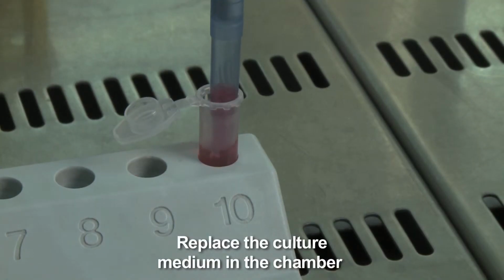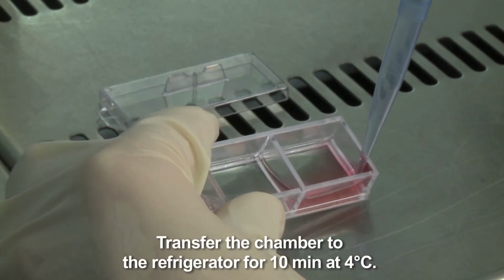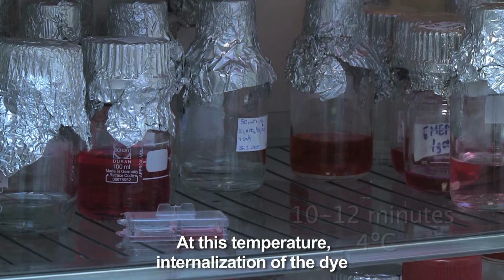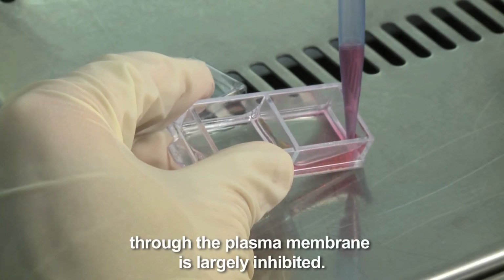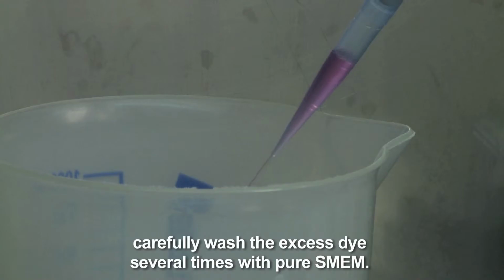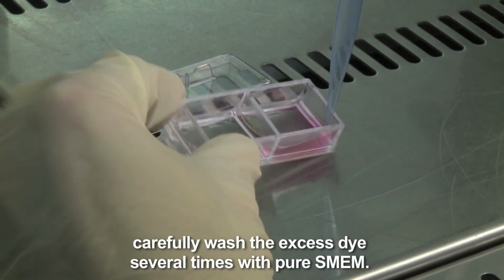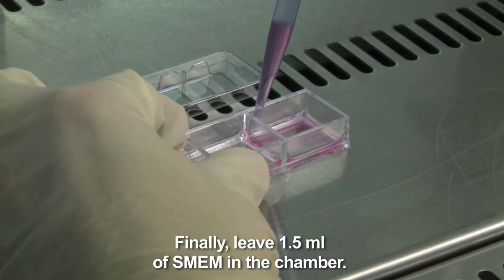Replace the culture medium in the chamber with the loading solution. Transfer the chamber to the refrigerator for 10 minutes at 4 degrees Celsius. At this temperature, internalization of the dye through the plasma membrane is largely inhibited. After staining, carefully wash the excess dye several times with pure SMEM. Finally, leave 1.5 ml of SMEM in the chamber.